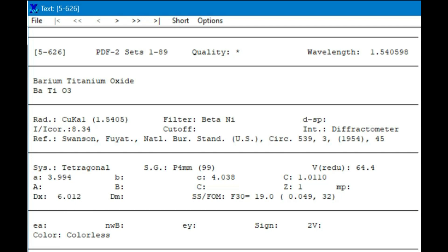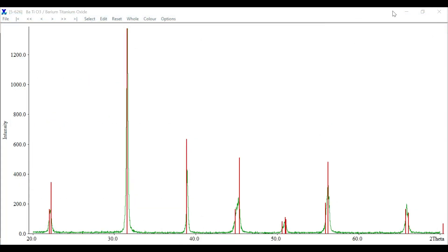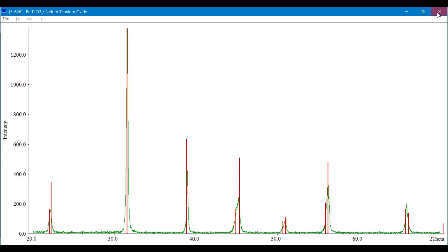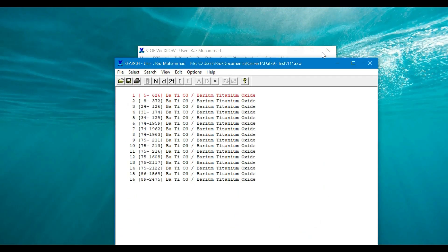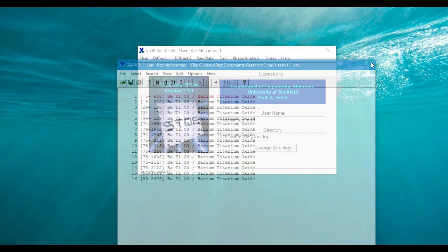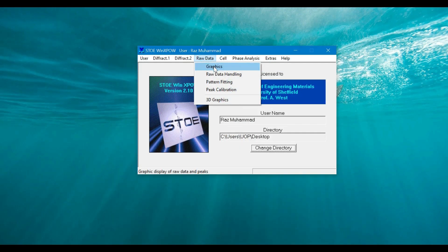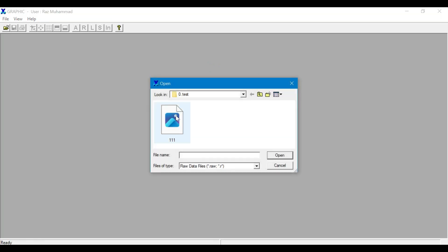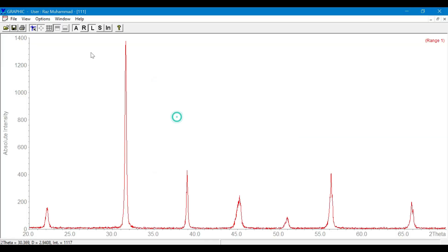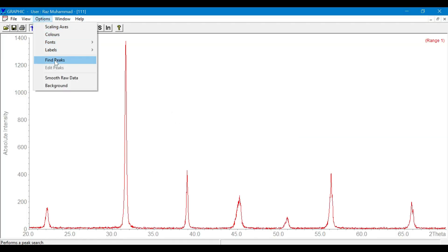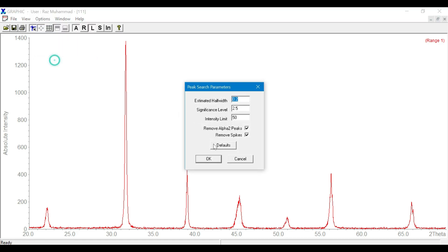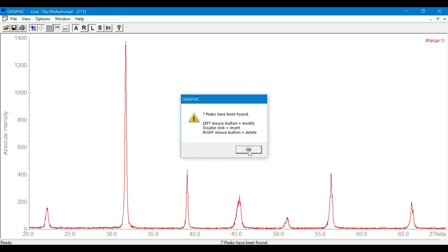Another way is to convert your XRD data file into peak format. It is helpful to automatically search your desired phase, so you may follow these steps.